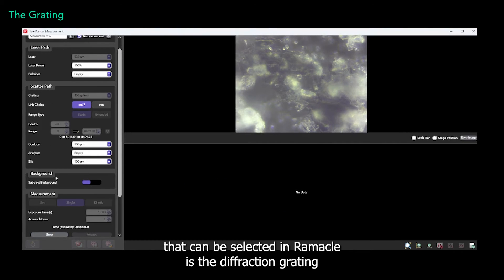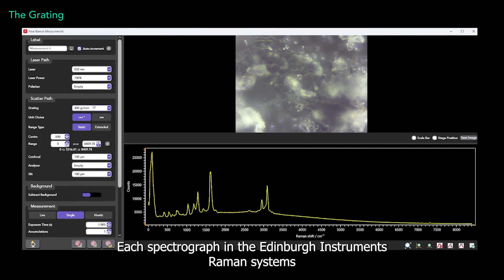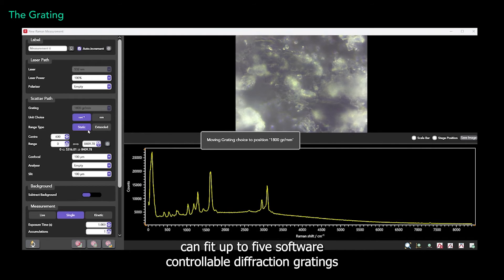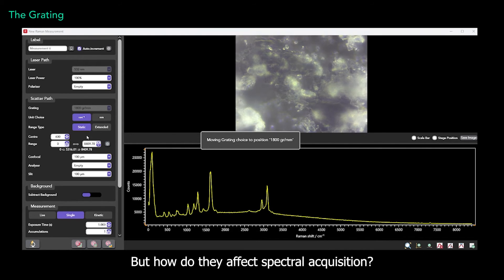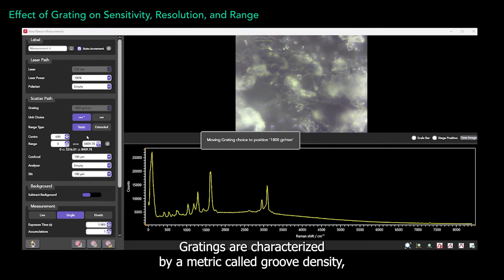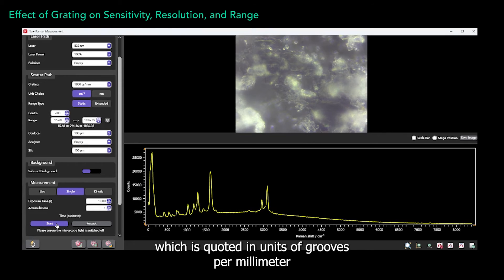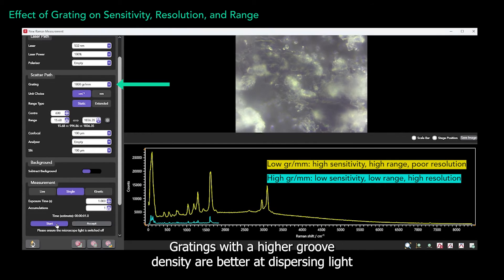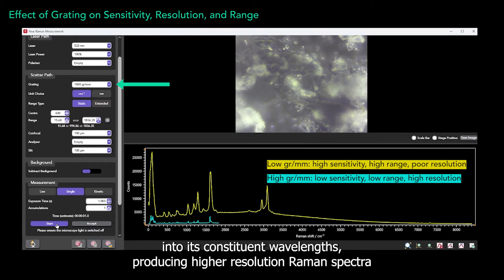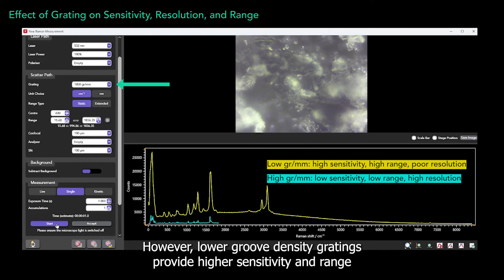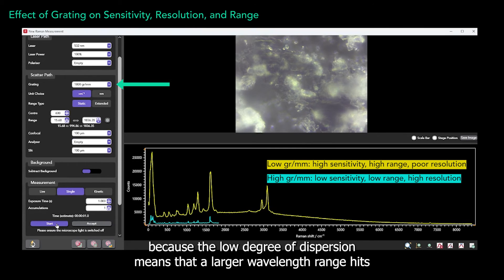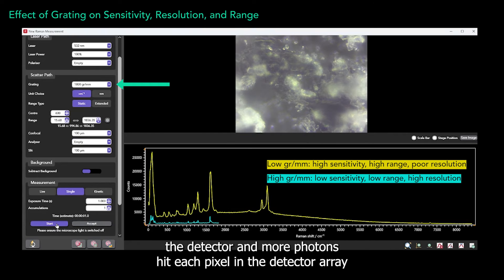The next component that can be selected in Ramico is the diffraction grating. Each spectrograph in the Edinburgh Instruments Raman systems can fit up to five software-controllable diffraction gratings. Gratings are characterised by a metric called groove density, which is quoted in units of grooves per millimetre. Gratings with a higher groove density are better at dispersing light into its constituent wavelengths, producing higher resolution Raman spectra. However, low groove density gratings provide higher sensitivity and range, because the low degree of dispersion means that a larger wavelength range hits the detector, and more photons hit each pixel in the detector array.